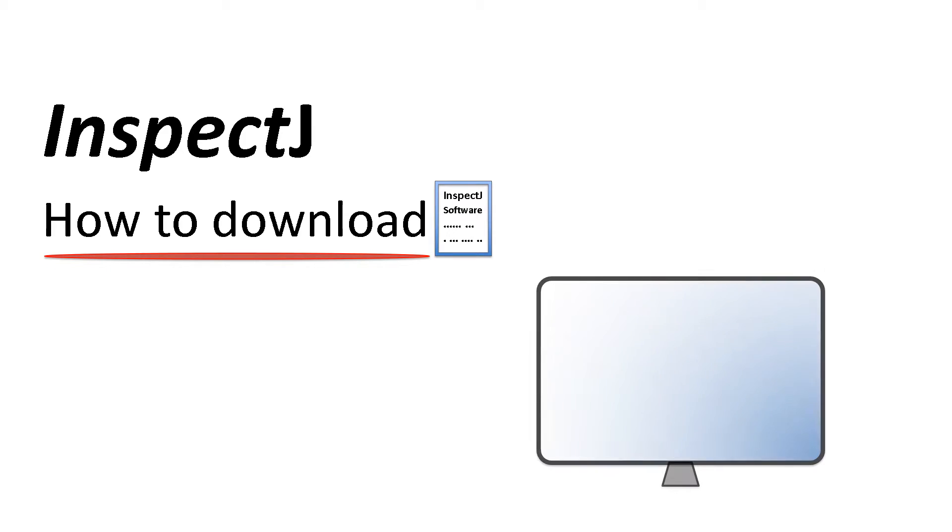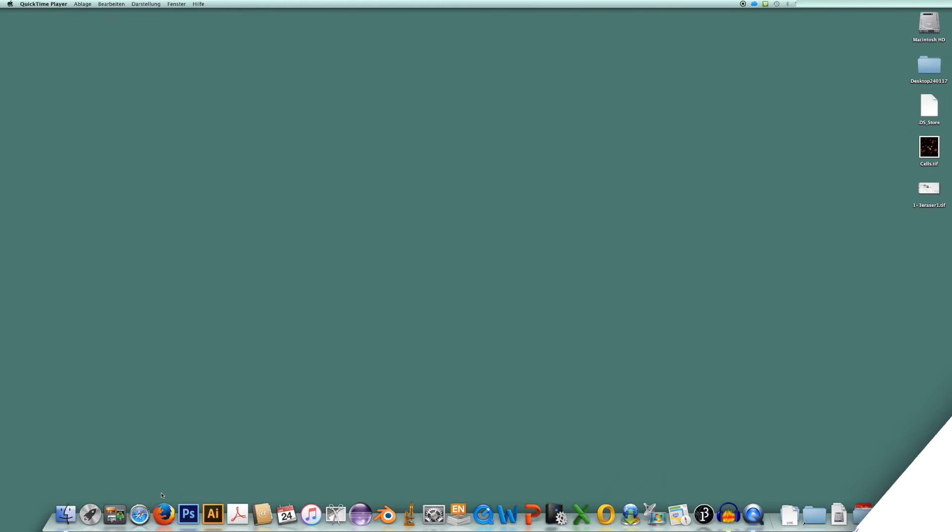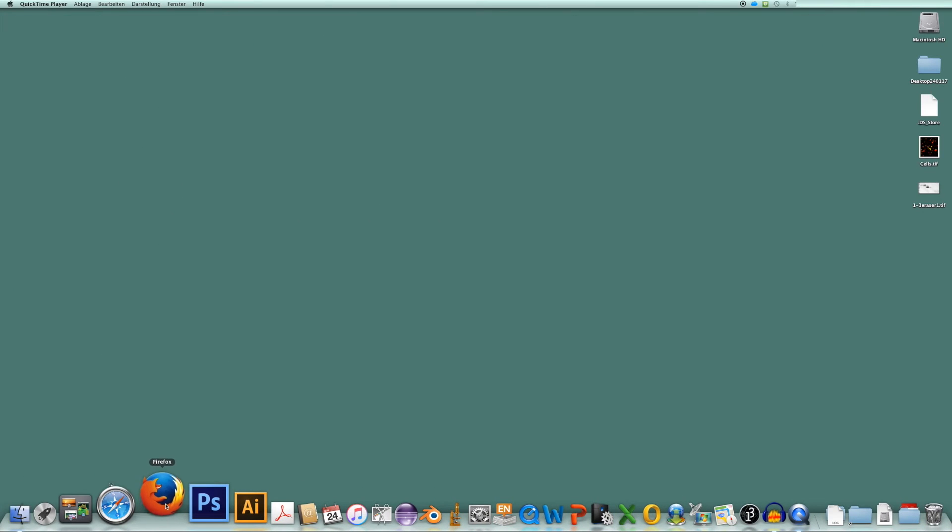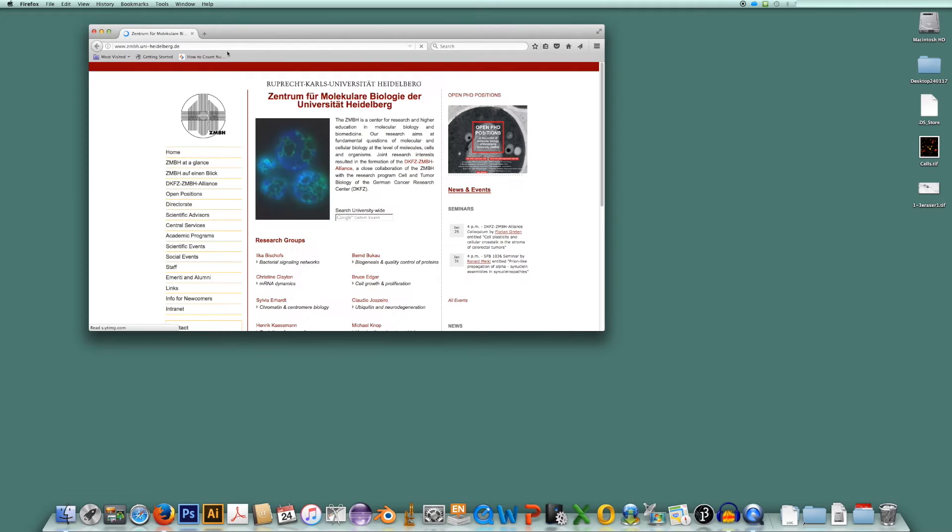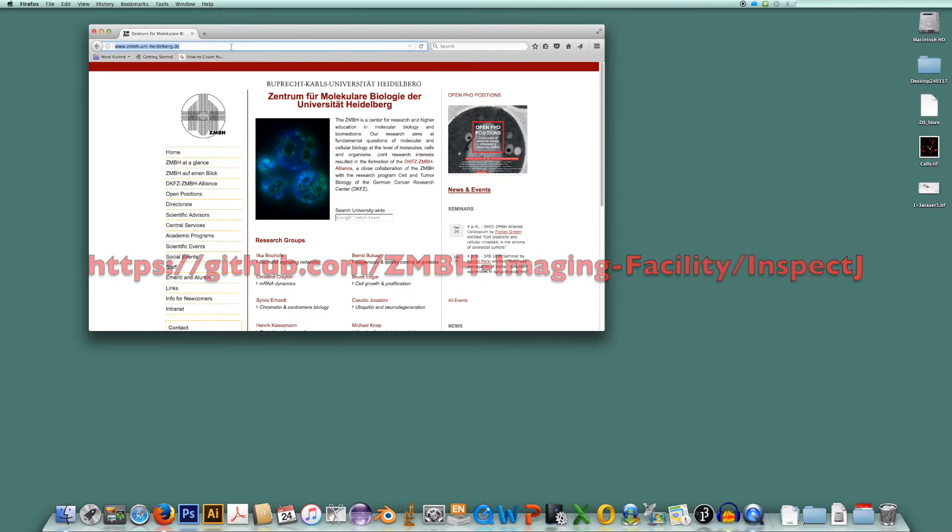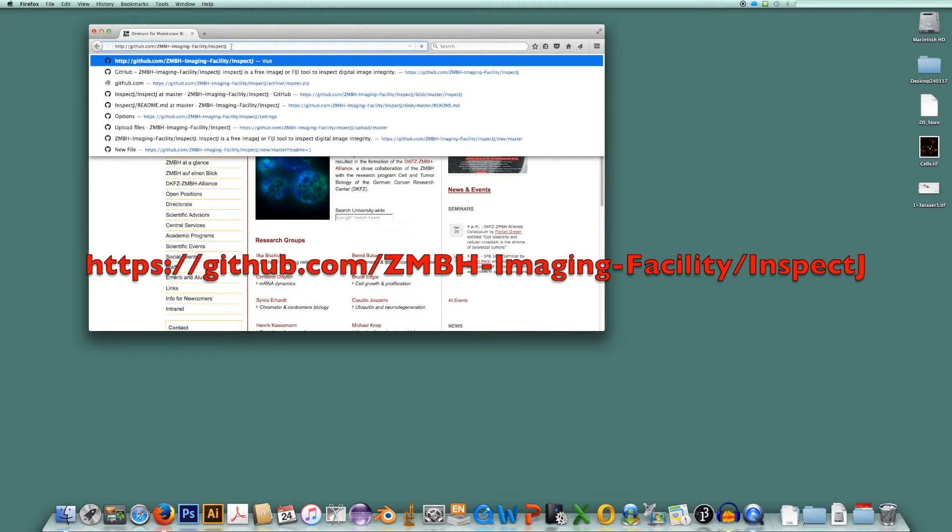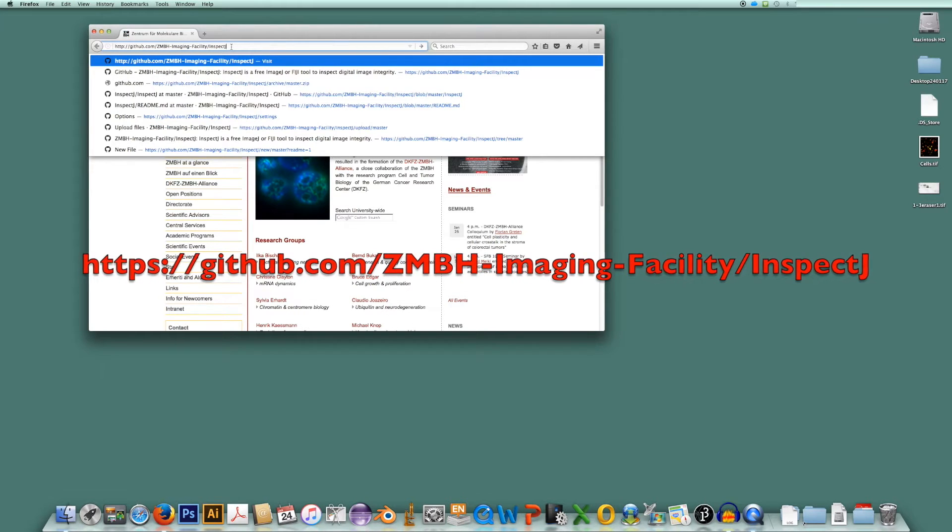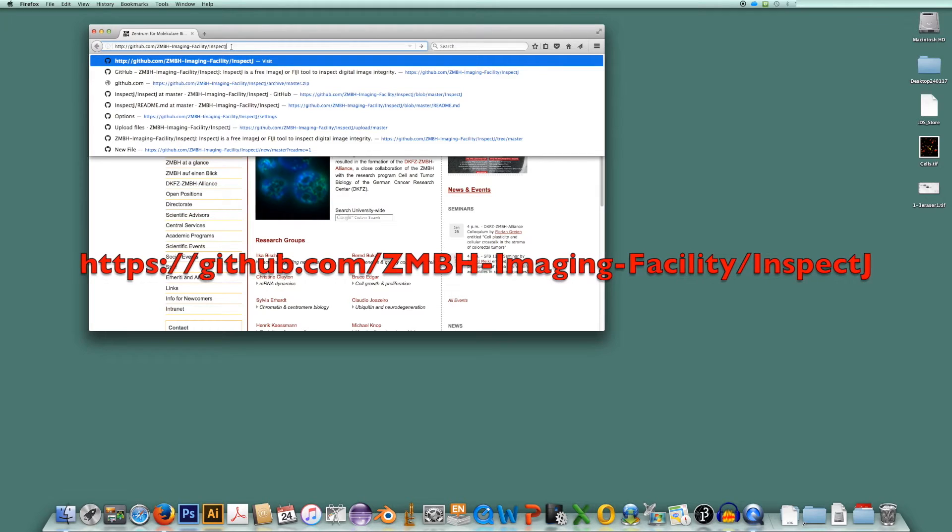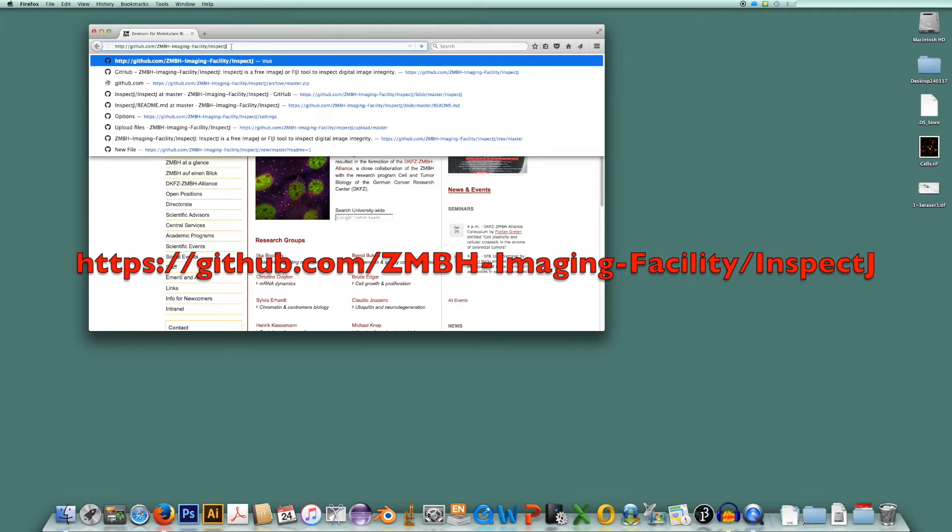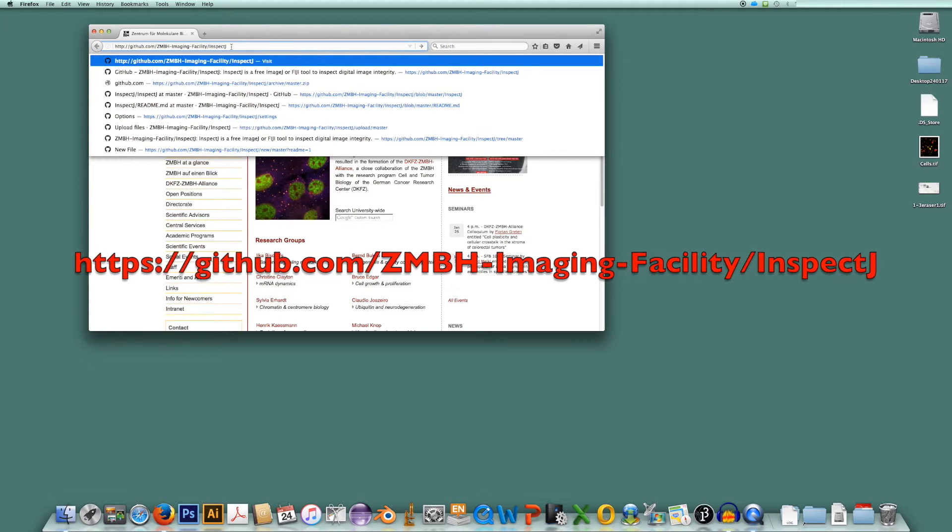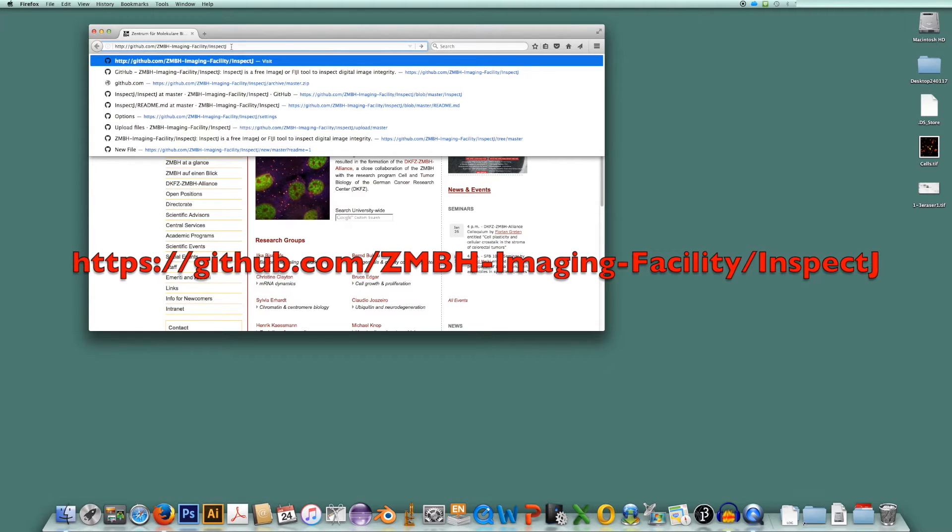Hi there! In this video I'm going to show you how easy it is to download the software InSpecJ. Just go online and go to github.com/zmbh-imaging-facility/InSpecJ.